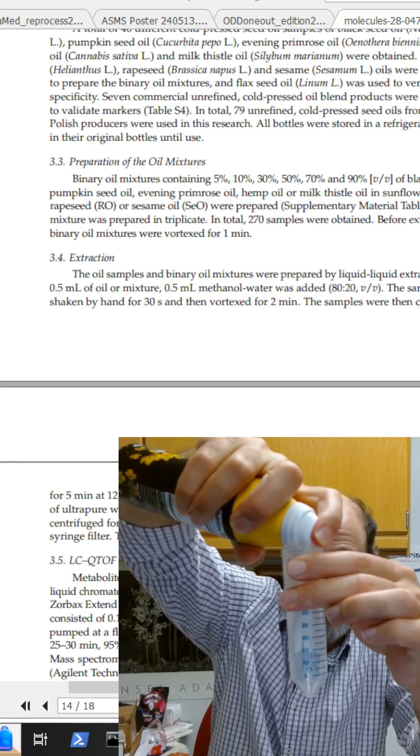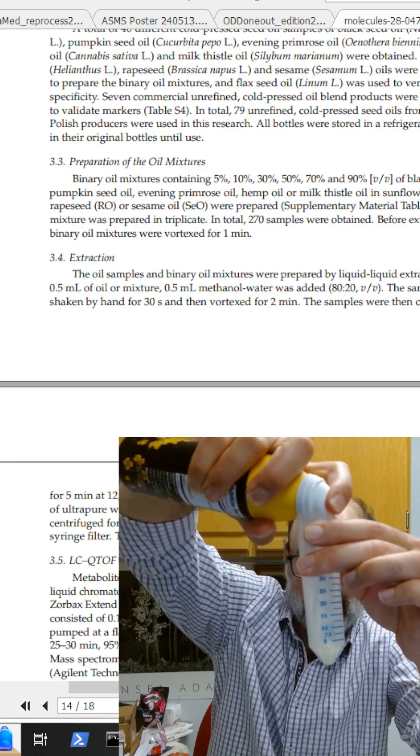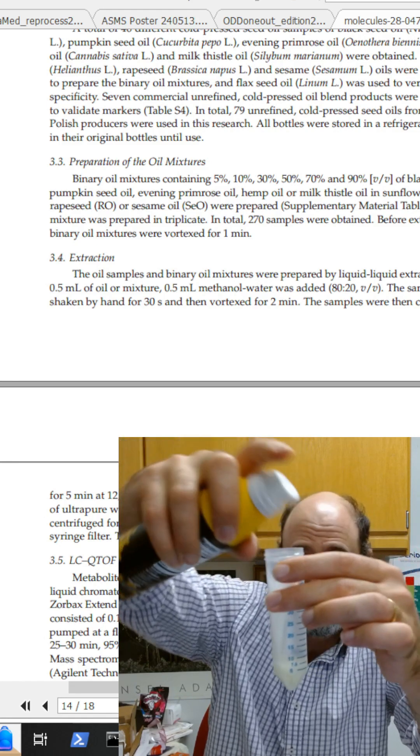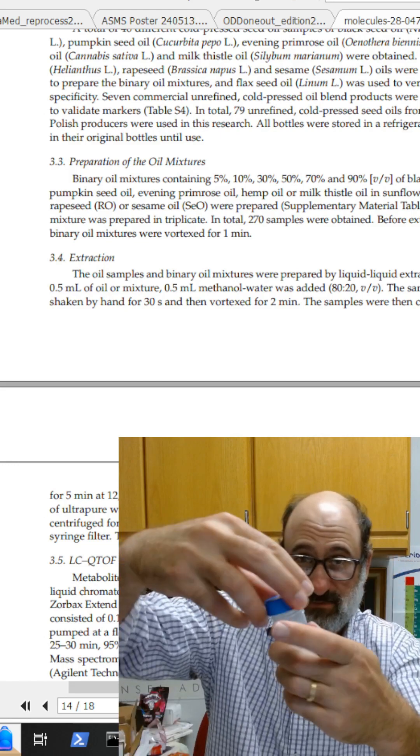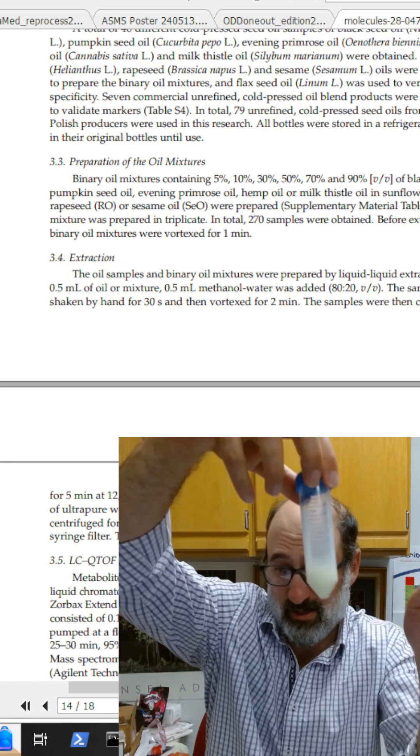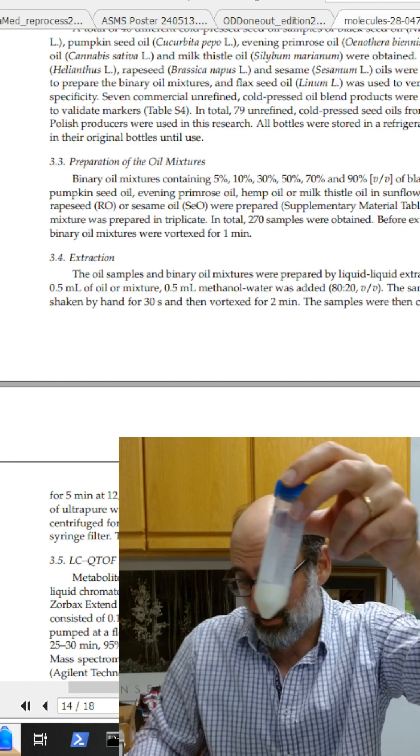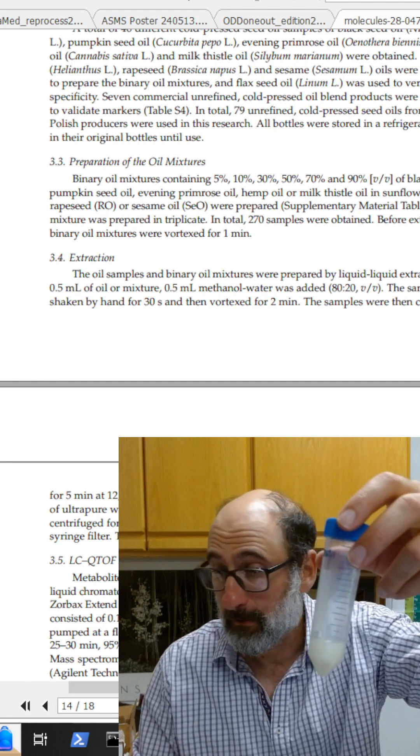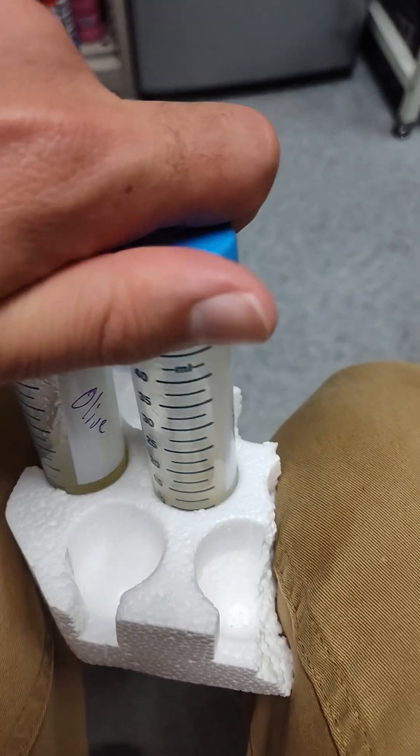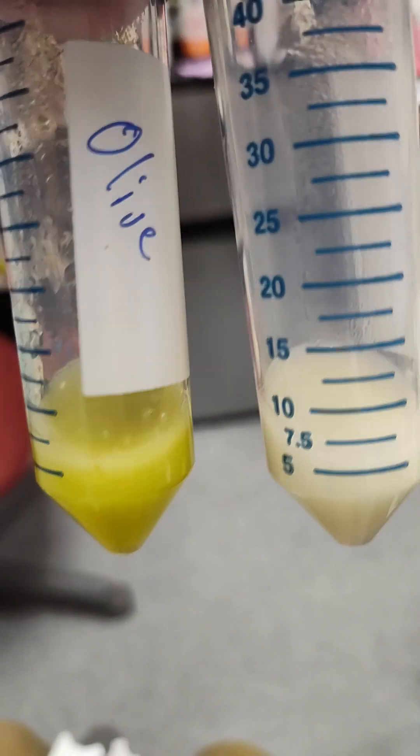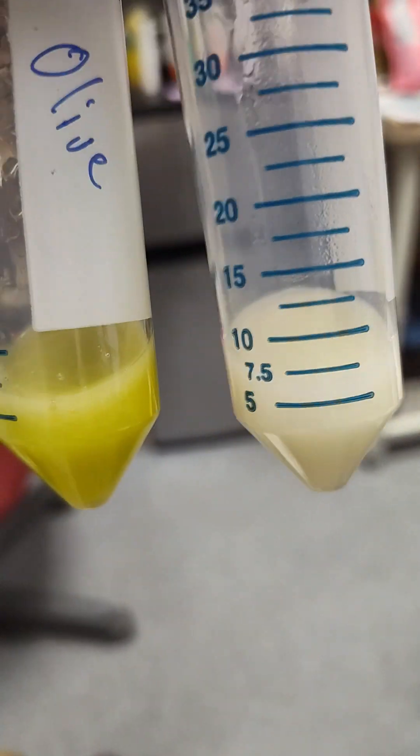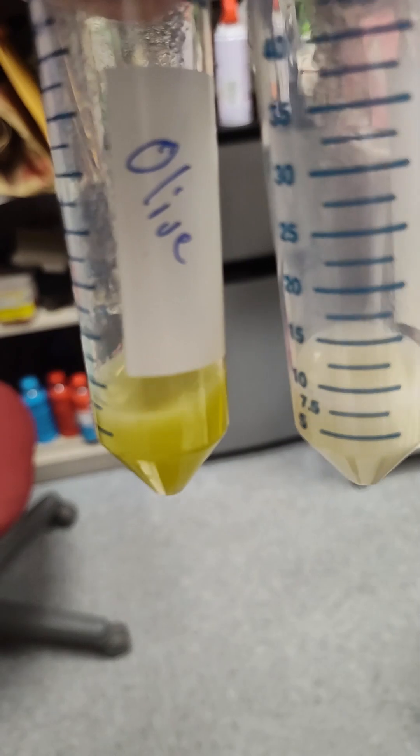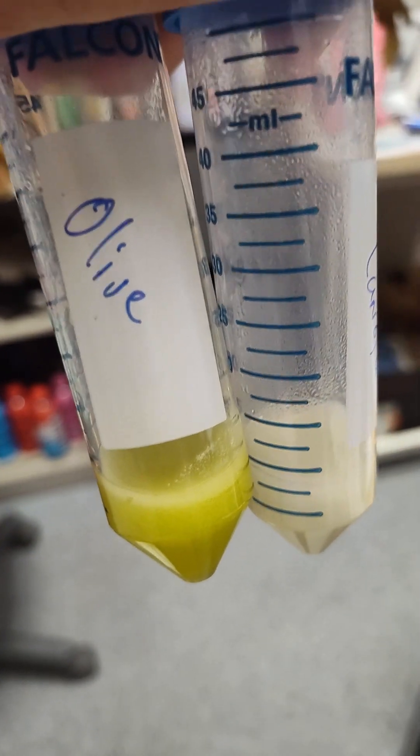There we go, a bunch of that guy. Very nice. I mean, there's no way this stuff is just oil. I mean, come on. So these guys produce a lot of bubbles. So I'm going to wait for the bubbles to settle out. But I'm assuming maybe it eventually will go clear. But this is pretty gross looking.